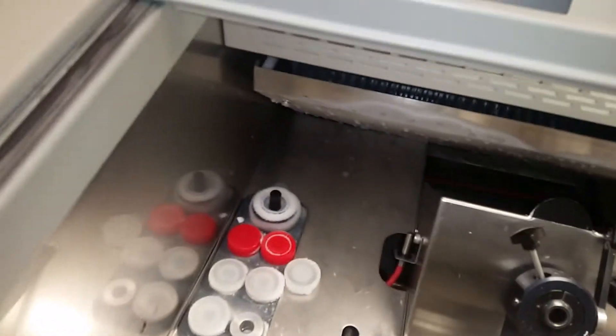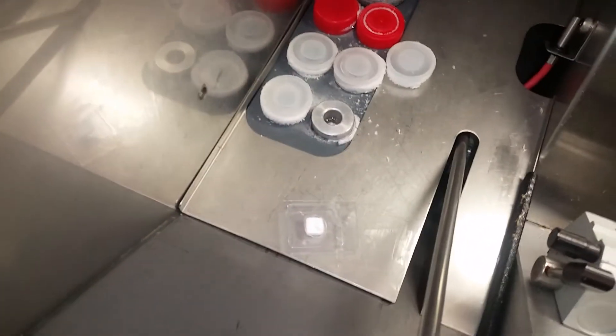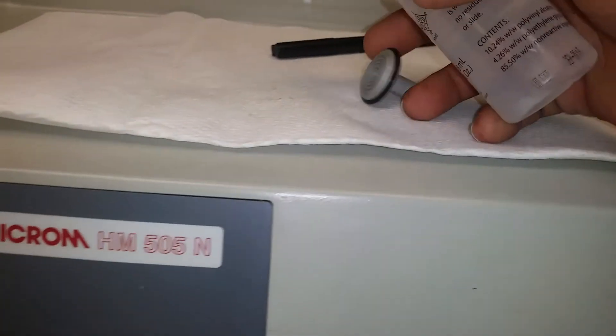I'm going to attempt to show you with one hand how I attach the frozen block. Here's a dummy block — no tissue in it — but how I will attach it to a chuck. I have a room temperature chuck right here, and I'm going to just kind of one-hand this.